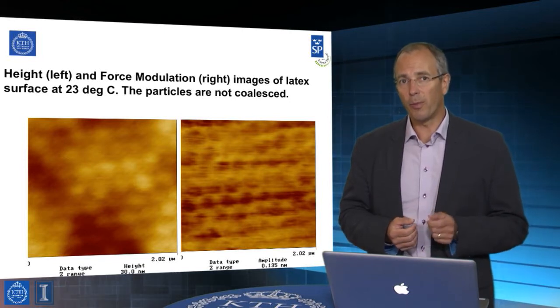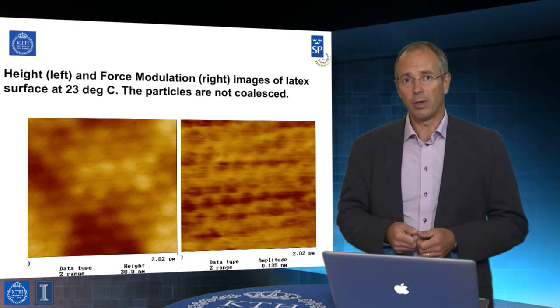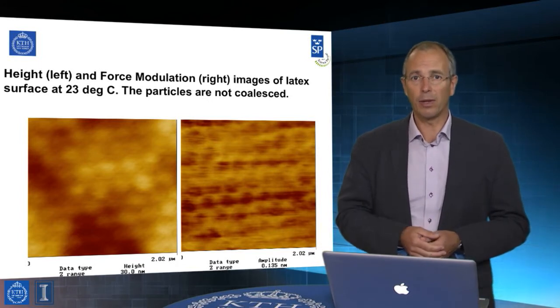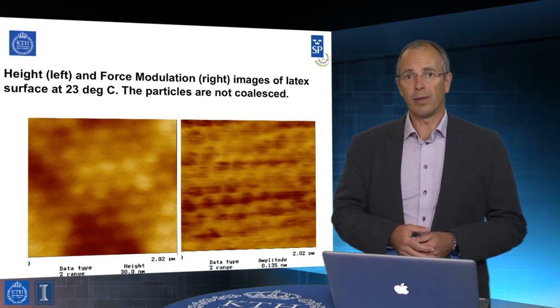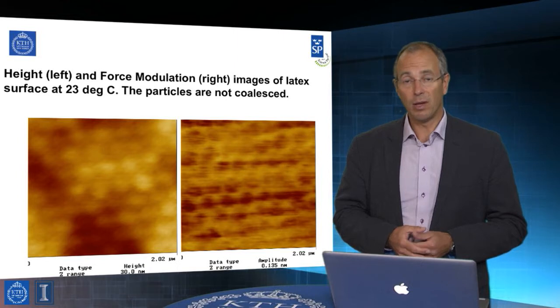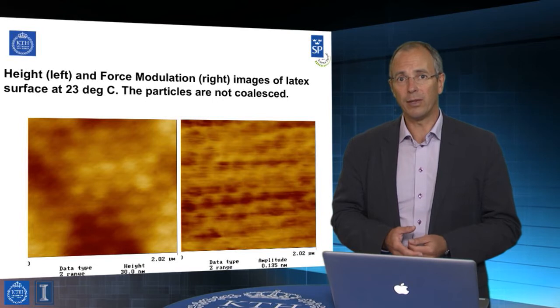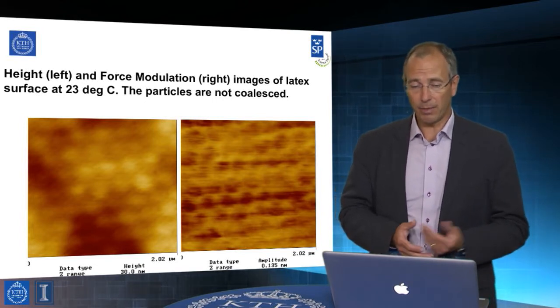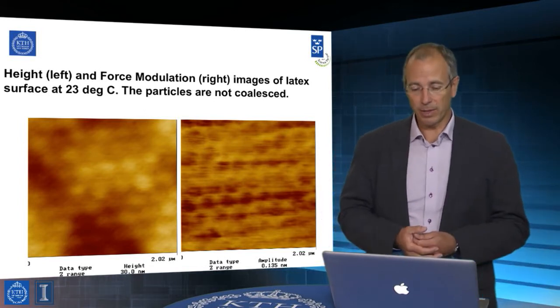essentially you could not perform the thermal treatment in the AFM. You took your sample, heated it up, and then put it in the AFM and had a look at the effect of that. With modern techniques, and with, for example, the instrument park that we have in our department and down at Albanova at the Centre for Dynamic Nanotechnology, we can actually heat in situ now. So these experiments could have all been performed in situ during basically over a day, instead of being the much longer process that it was at the time. We would have got the same information essentially.